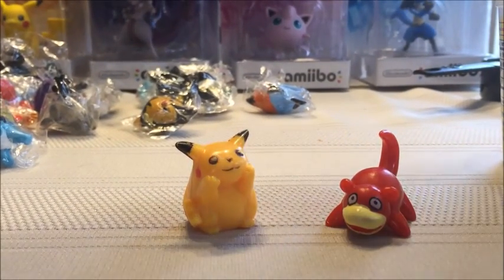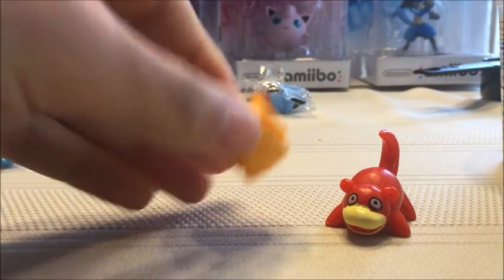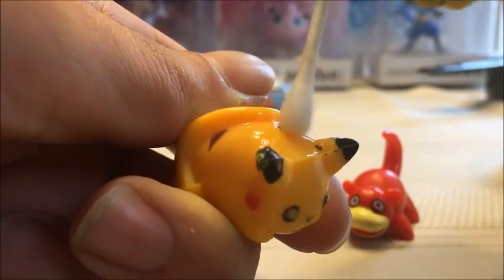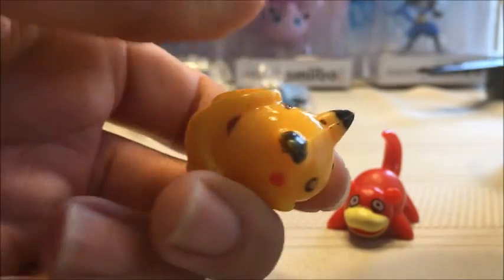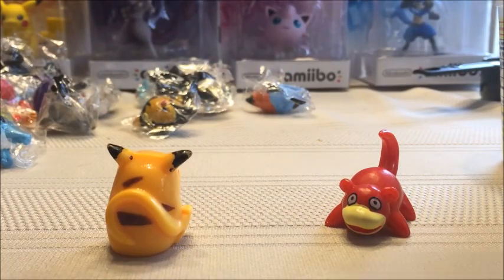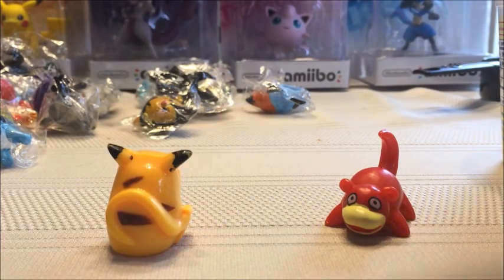First, I need to clean the surface of the figure I want to test with rubbing alcohol for one minute. Let me flip the Q-tip around. Let's clean these ones because that one has to dry.